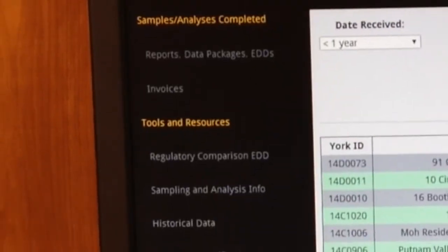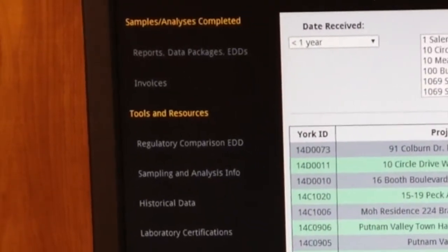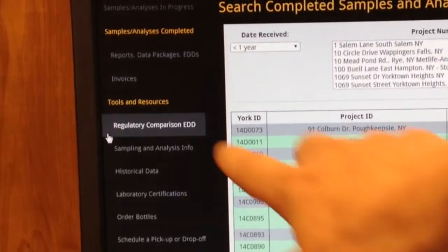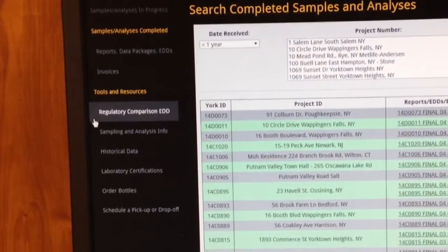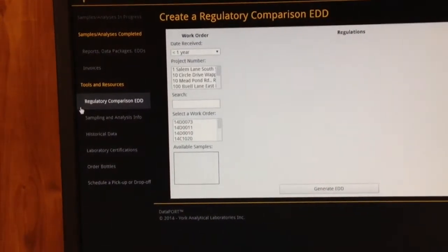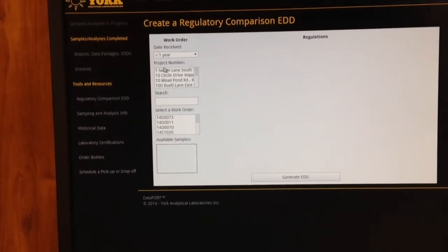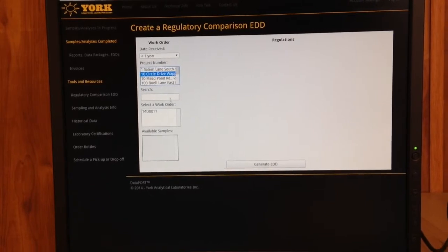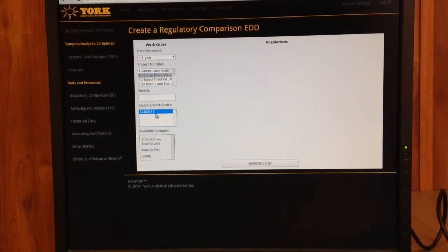Another utility that's fairly recent is our Regulatory Comparison EDD. It lets you create the Excel files yourself. If you click on here, it's just the way we started to show you in the last couple of months.